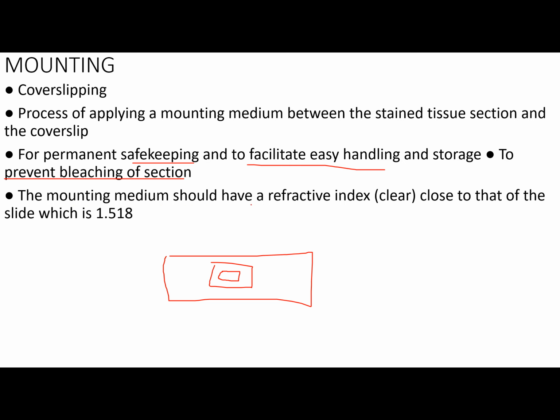Now, the mounting medium, please take note, should have a refractive index, or what we call clearness, close to that of the glass slide, which is 1.518. So take note of the refractive index 1.518.